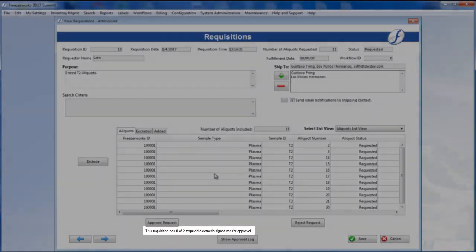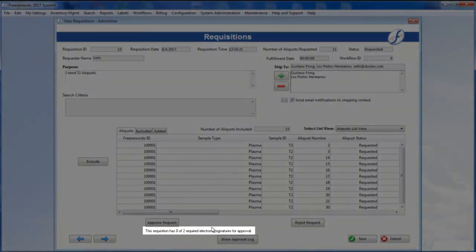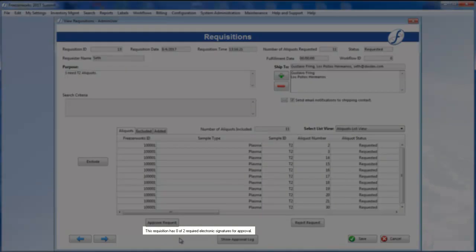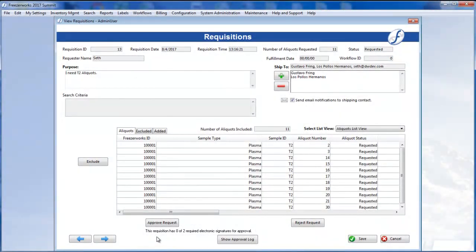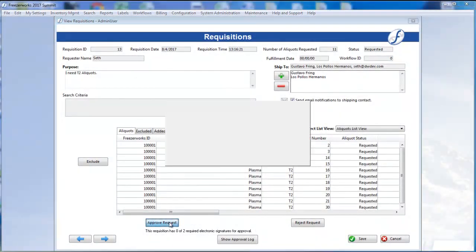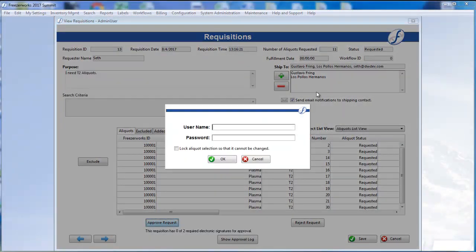there is a little message beneath the Approve Request button, which indicates that two e-signatures are necessary to approve the requisition. Let's click Approve Request, and a small login type dialog appears. Enter your username and password.